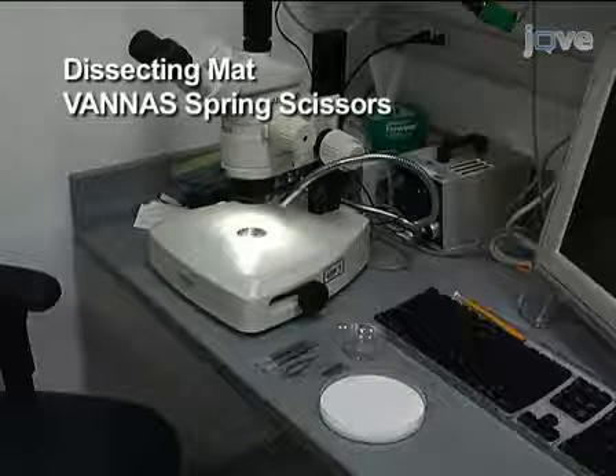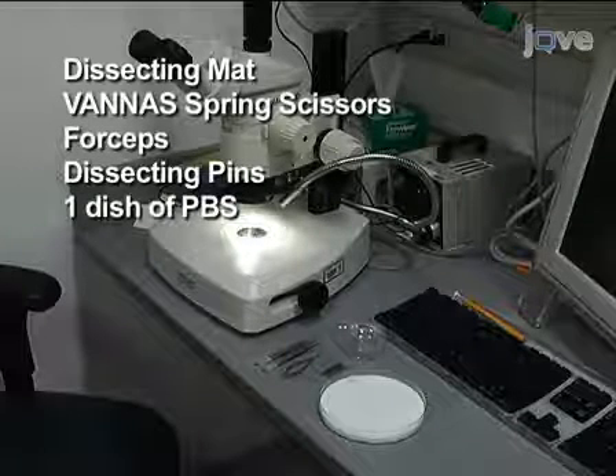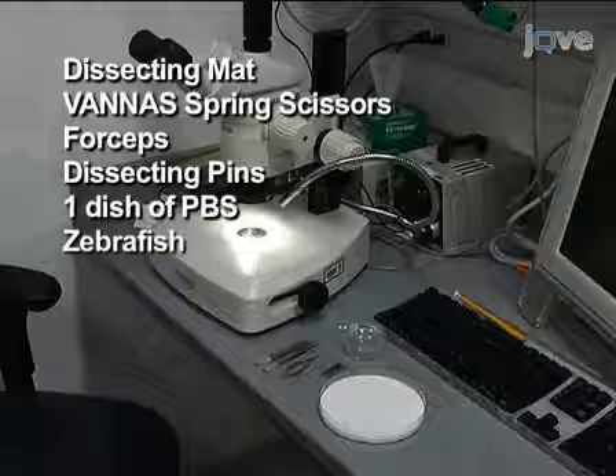You will need a dissecting mat, Vanus spring scissors, forceps, dissecting pins, a dish of PBS, and a fish that has been anesthetized and euthanized.